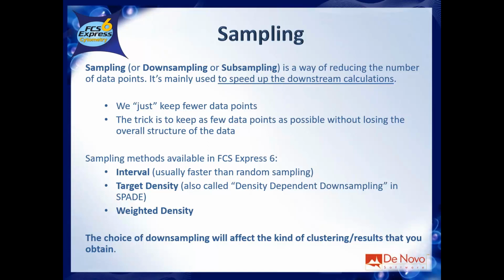Before going into any details, I want to point your attention to this concept, the density. When you think about density, for example, the density of people in a given area, or the density of a compound in a volume, you always need to specify the reference. So either square miles or square meters, or liters for volumes. So you need a reference. Which kind of reference can we use for flow data?